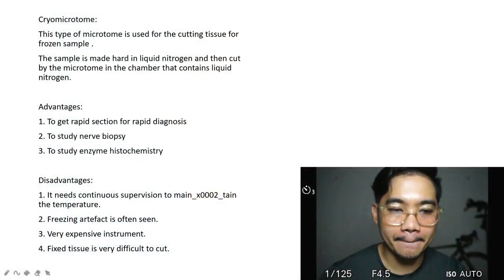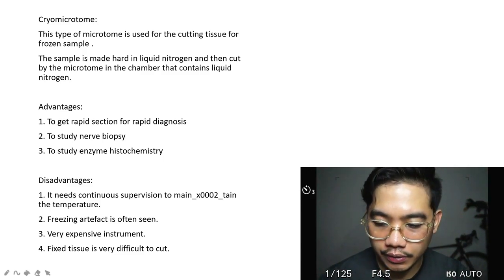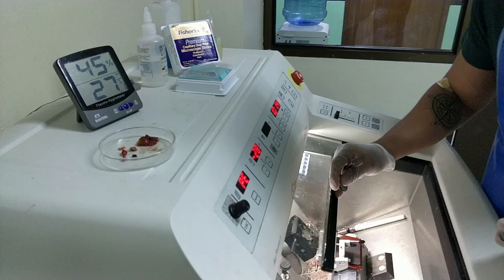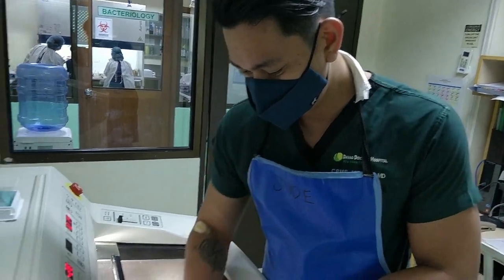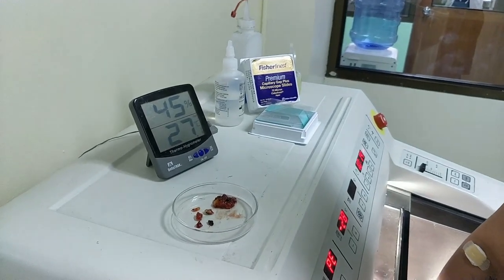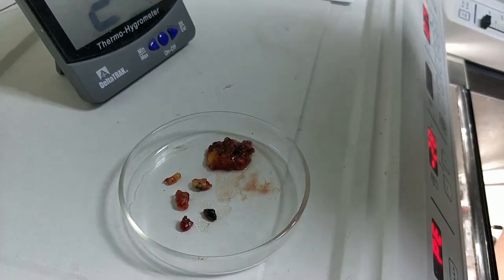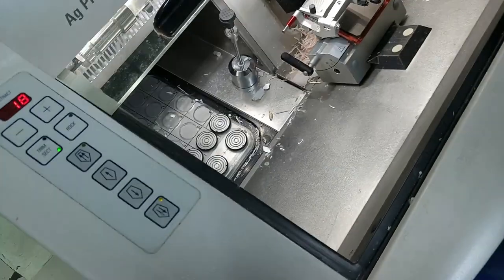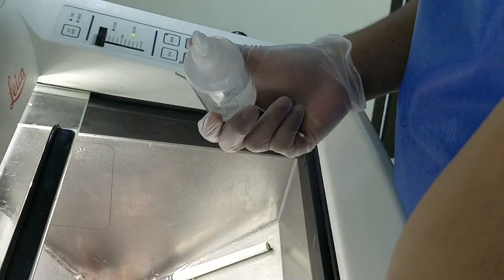going back, I'm gonna show you a video of a frozen section that we did, anyhow. No, this is Dr. Cyril, Dr. Iglawas, oh. That is the pathologist. So, this is the specimen. Then you can see there, those are the specimen chucks. And this is our freezing media.